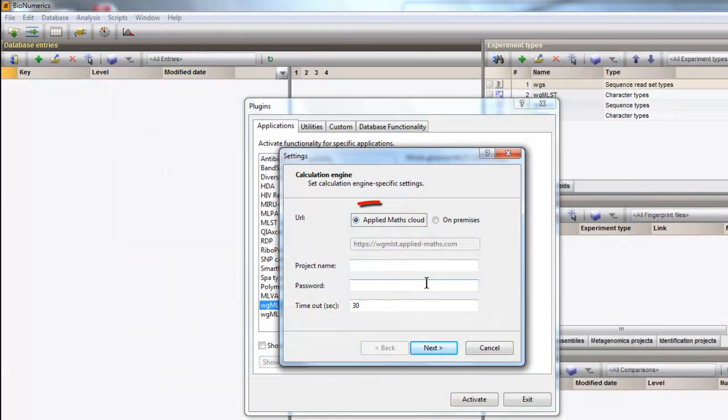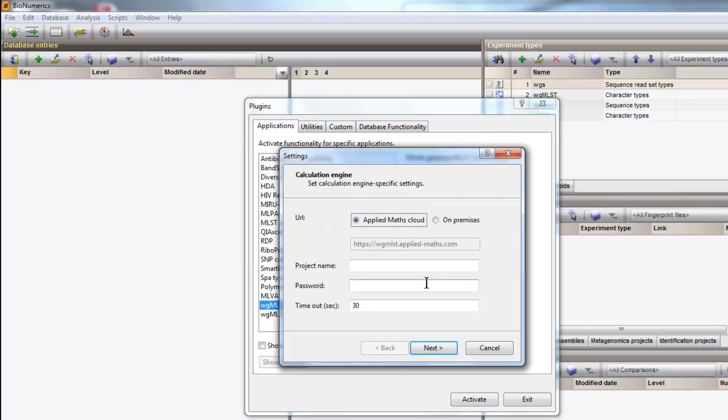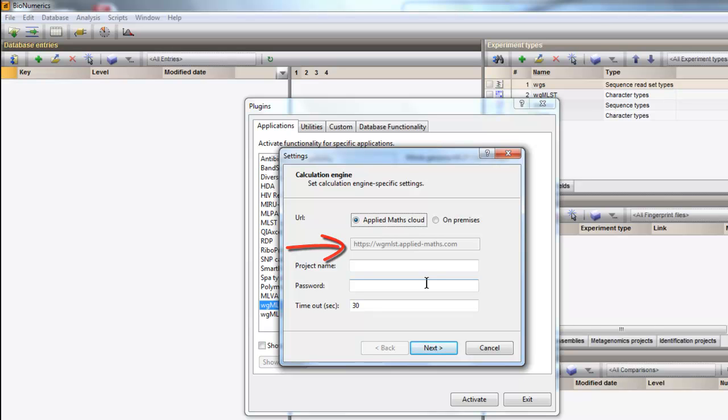The user can choose between a virtually setup-free pay-per-user cloud solution or a local deployment. To connect to the calculation engine, you first need to define the URL of the Applied Maths Amazon Cloud or a locally installed instance.